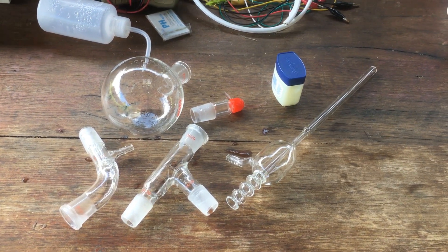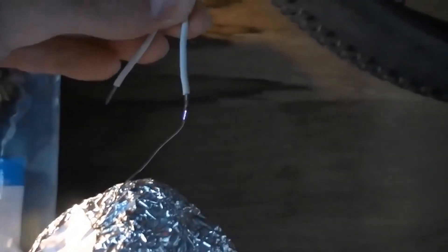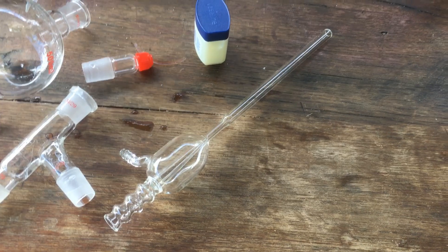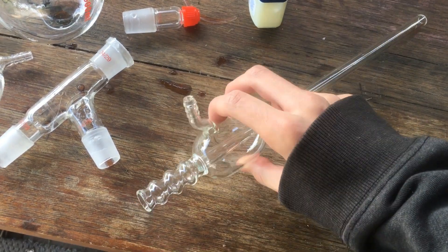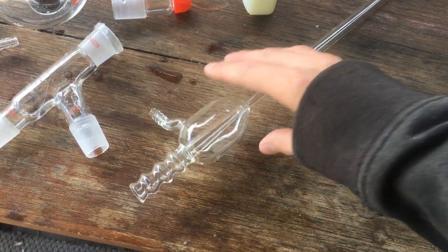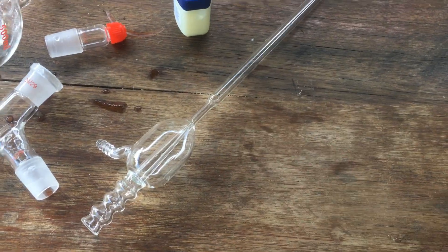Hi guys, Harry here. Welcome to Scrap Science. So from the title of this video, you can probably tell that I'm now in the possession of an aspirator pump. This is a vacuum pump that just uses running water to generate a pretty reasonable vacuum.